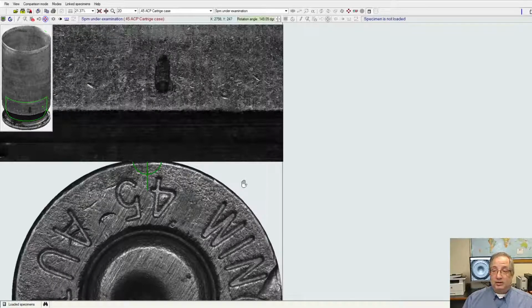So that was my quick introduction to setting the phase relationship with the Evofinder software. If you have any questions, please type them into the question window and we can answer those for you and follow up with you. Otherwise, we'll be back in 2 weeks where we're going to talk about the different modes of viewing, the 2D, 2D plus D, and 3D, which I sort of used a little bit but didn't talk about, and show those functionalities with some of the lighting controls.